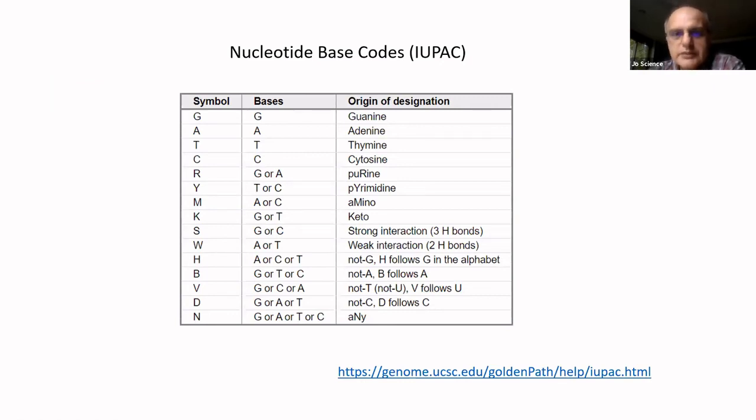This is the only allowed letters of nucleotide base codes. And this is something which frequently leads to the failure of the analysis, when it's enough to have one character not from this alphabet in a 10 megabase file, and it will stop the algorithm from the generation of the output.